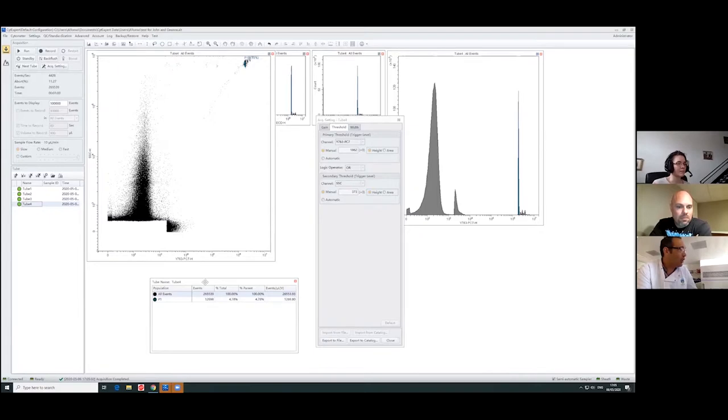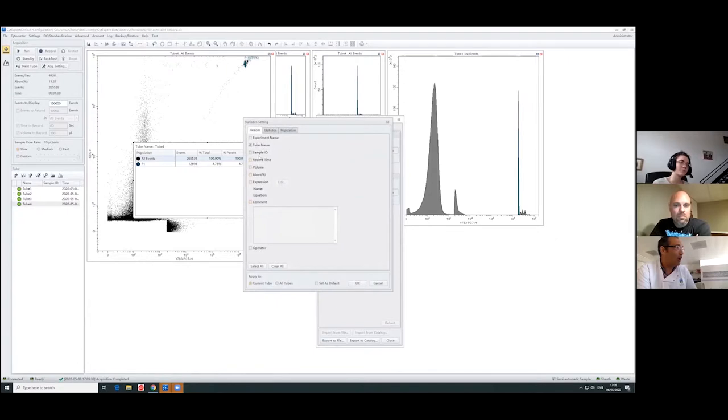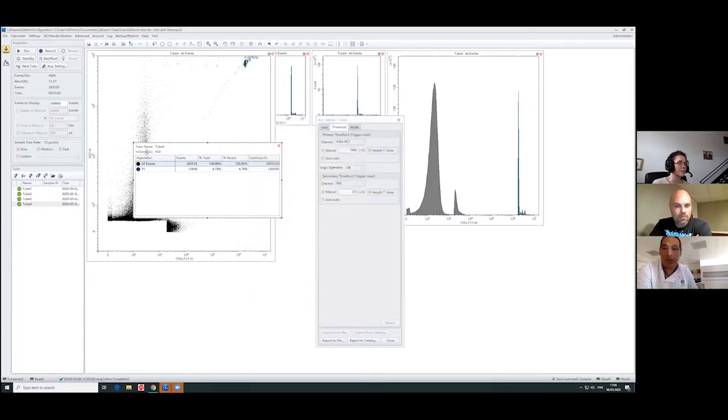Okay, the other thing is how much volume I spend. So I can go to my statistics tab, go to settings, and ask how much volume I have spent on this analysis. I will ask this for all my tubes, and you can see we have spent 10 microliters, which is exactly what it's telling me here. Sample flow rate, 10 microliters per minute. Okay, so you only spend 10 microliters of your sample.